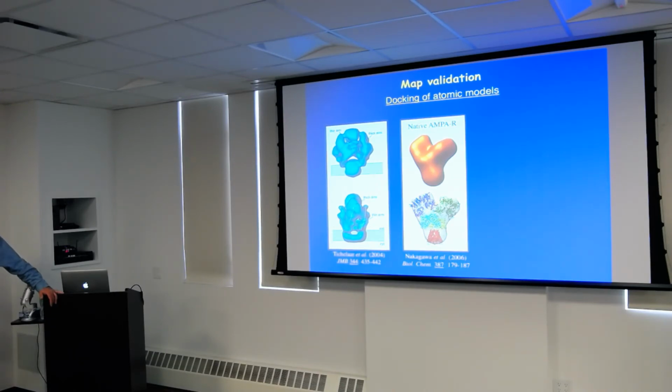Reproducible basically means you run the program once, and because you start with different references, you could end up with a different result. So if averages look the same in the first run and in the second run, then they're reproducible. If you just get a particular average in one of the runs, but you don't see the same average in the second run, that's not reproducible, so you don't trust it. Thank you.